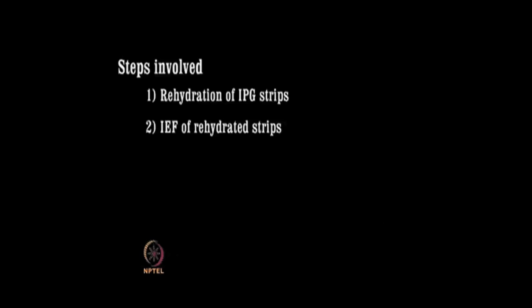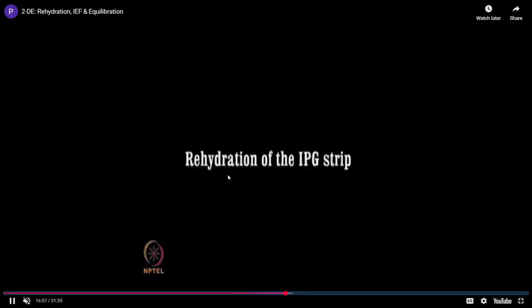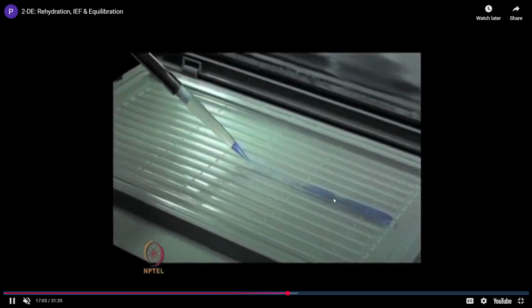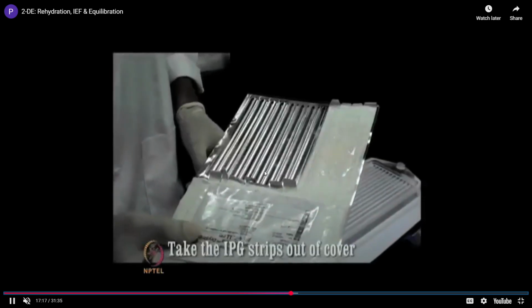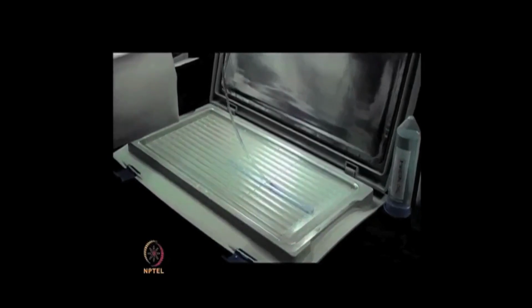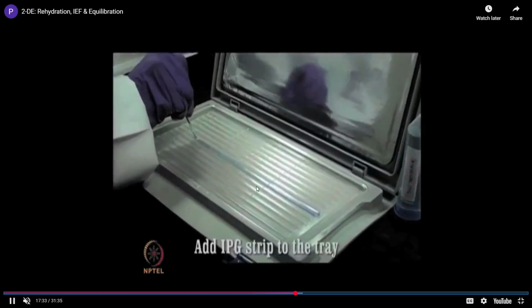First, you will do the rehydration of IPG strips and the isoelectric focusing of the rehydrated strip itself. This is how the rehydration happens. In the tray itself, we will add the IPG strip and rehydrate it first with the specific rehydration buffer which we just discussed. This is how the strip looks.